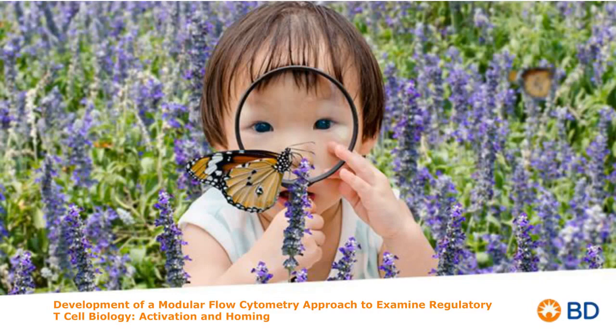Last question. Do I need to worry about my base panel impacting my drop-in panel resolution? So does your base panel sometimes impact your drop-in panel? Absolutely. So that is of concern, and so we thought about it from a perspective of what we want to have: drop-in fluorochromes that are rather diverse in utility. So something that's bright or moderately bright, and then try to put them in particular laser choices.